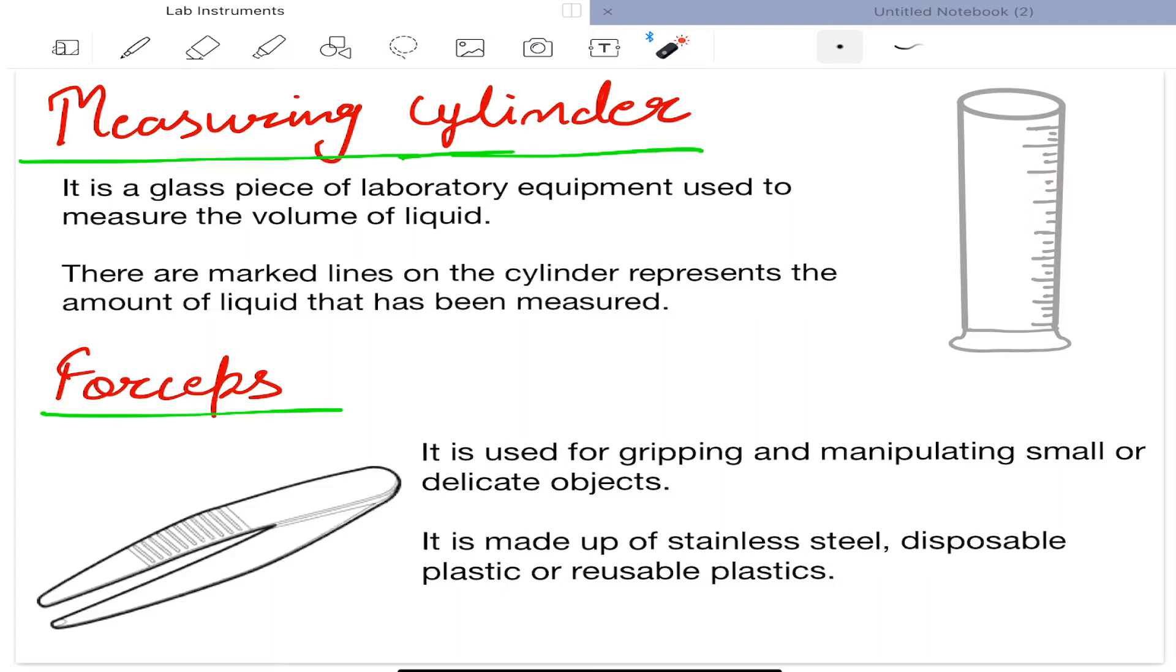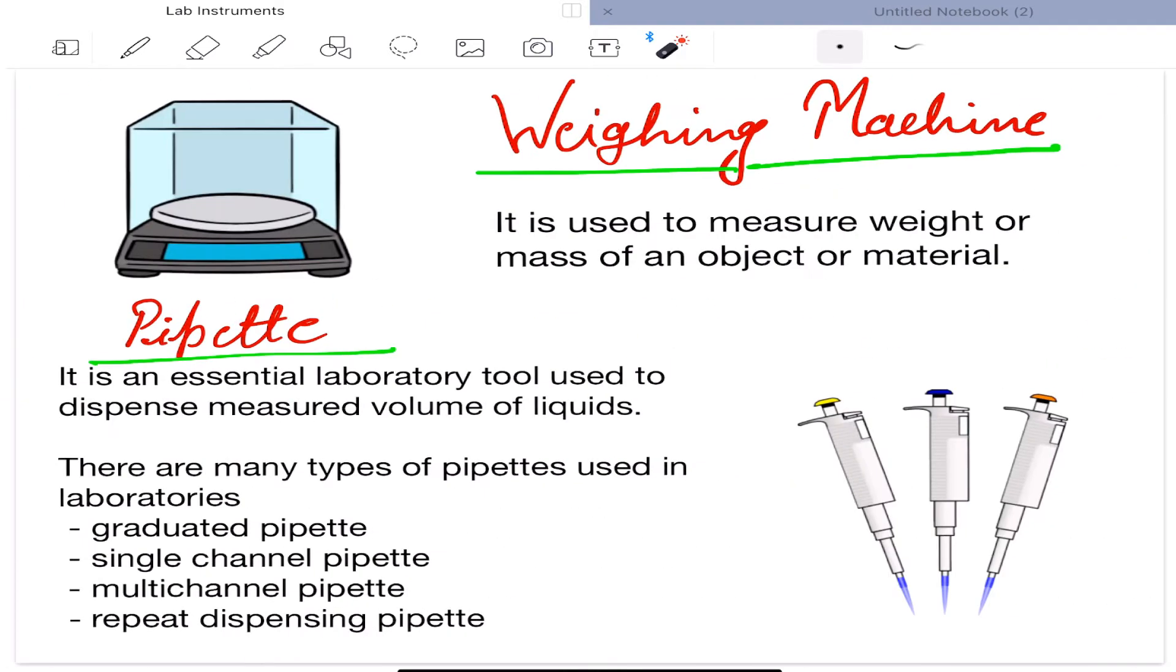Next is forceps. It is used for gripping and manipulating small or delicate objects. It is made up of stainless steel, disposable plastic, or reusable plastics. Next is weighing machine.